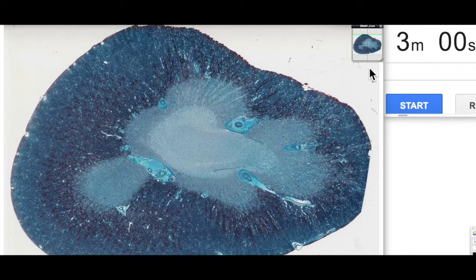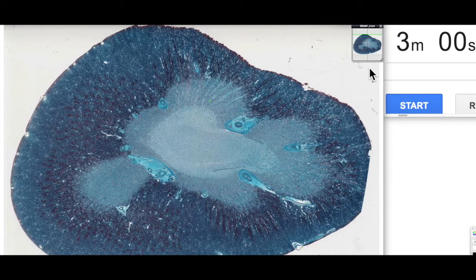G'day everyone, 3 Minute Histology with Jamie Chapman here. Today we're going to continue our series looking at different types of epithelium, and today's episode is going to focus on simple cuboidal epithelium.